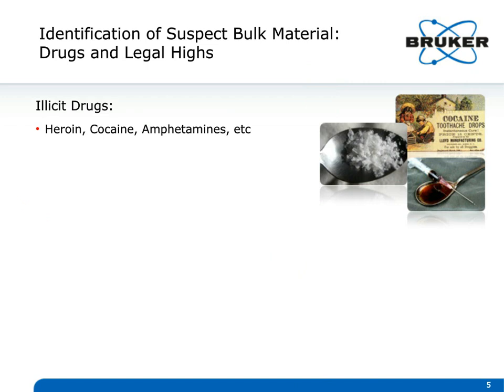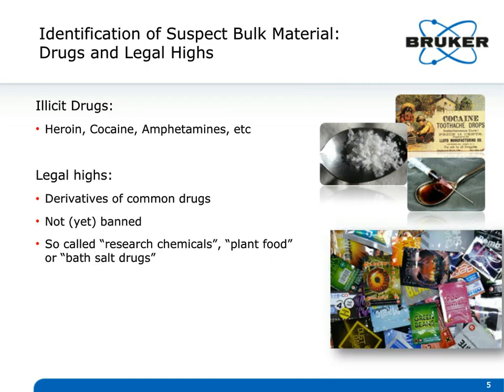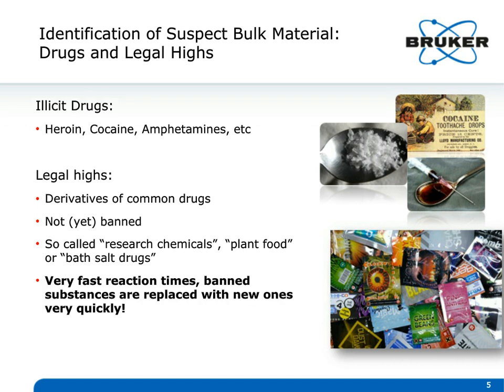So when you look in the bulk material, and I'll separate these examples from looking at the bulk materials to looking at microscopic samples. In this case, again, we're looking at heroin, cocaine, amphetamines, and of real interest in today's world are legal highs. So people going to nightclubs and not remembering what happened and when, and being able to react to new drugs, the new fashion of drugs that are being used for people to get high, it's a really dynamic and fast-moving area of science, and one where spectroscopy can really be most useful.